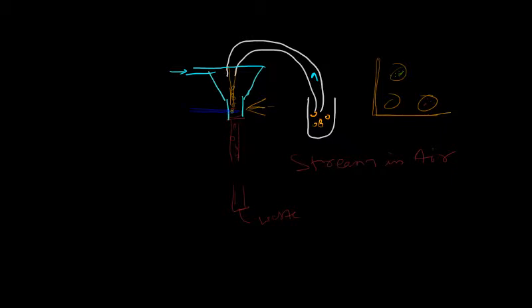There are other sorters which can physically pick the cell. There is an actuator arm which can physically pick the cell. Now there are acoustic switching systems also. So those are the different types of sorters available. I'll be primarily discussing the stream-in-air sorter, and that is something that is going to be there for quite some time now.